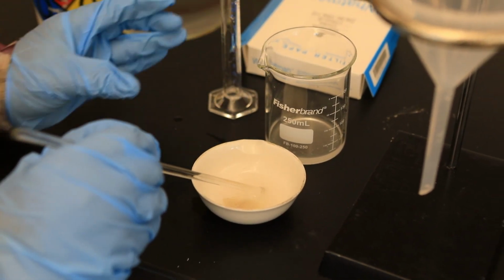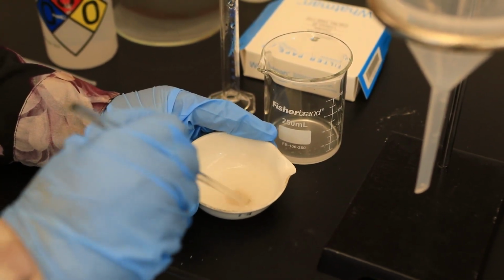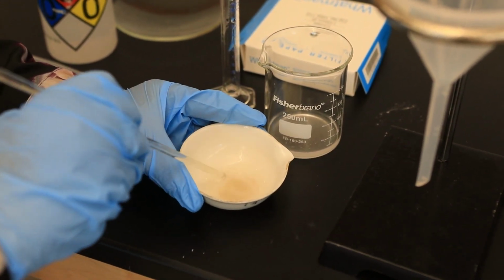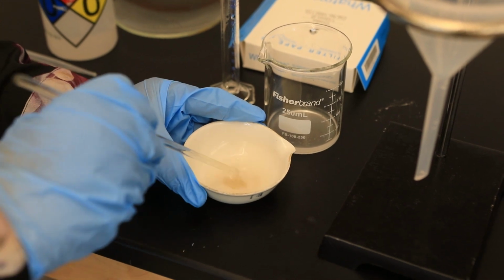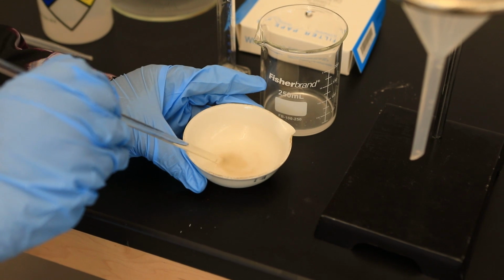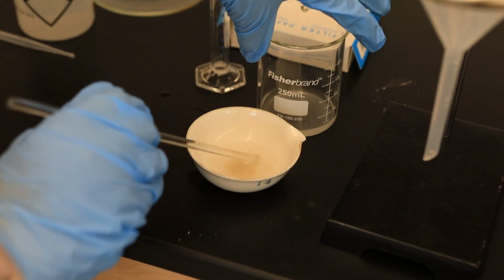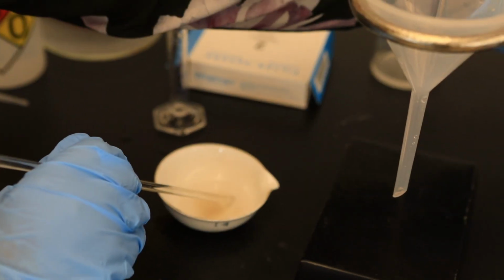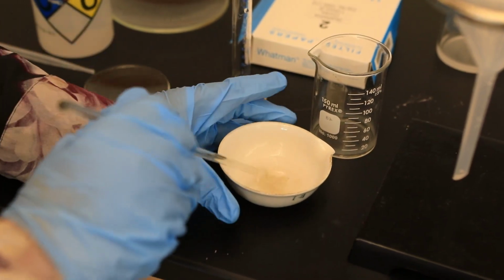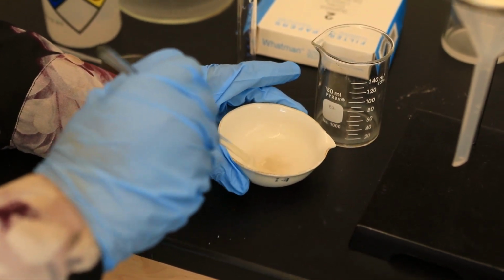Okay, so now I've added the complete volume of hydrochloric acid. There's no more fizzing, so I know that the reaction is complete. But what do I now have? I have my solution, and that solution is a solution of what? Calcium chloride. I cannot discard that solution. Why not? Because I need to work on that solution later so that I can recover the calcium carbonate.